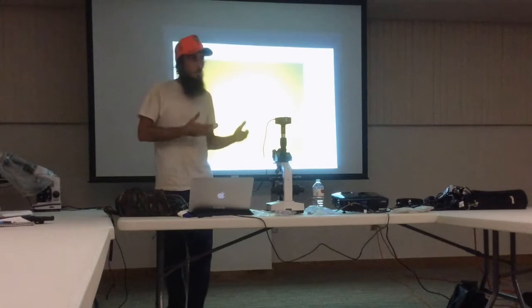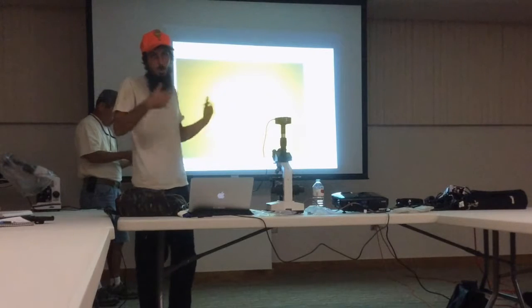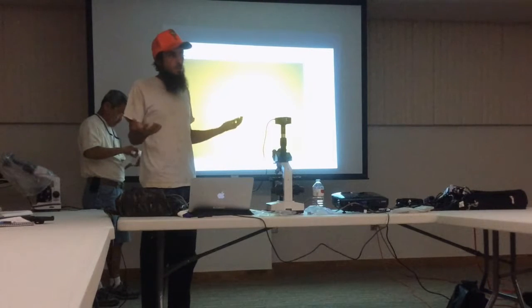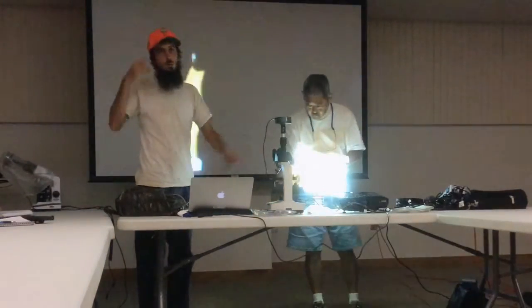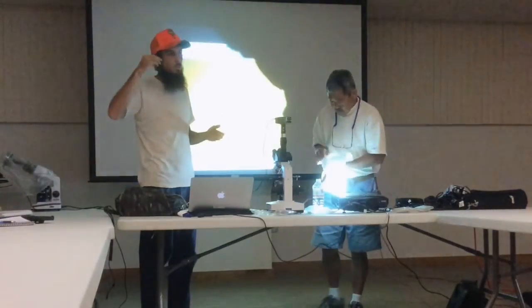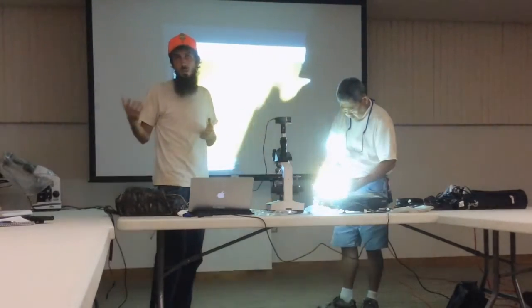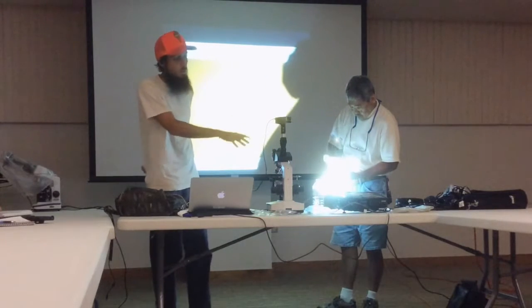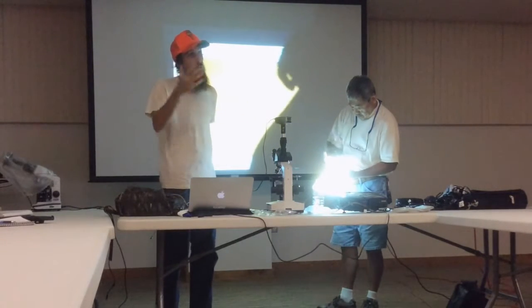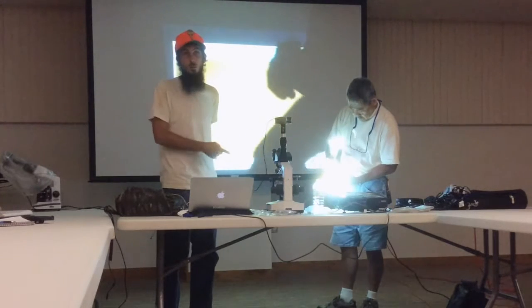Because before that, I'd been like, you make up an IMO 4 pile, or you make your IMOs, and is it good? Is it not? And so this tool right here, and understanding the beneficial fungus, gives you a real quick way to check. You can save time, money, energy, all that, just quickly. And especially when I'm doing compost teas and brewing things, I like to look at the organisms before I use them.